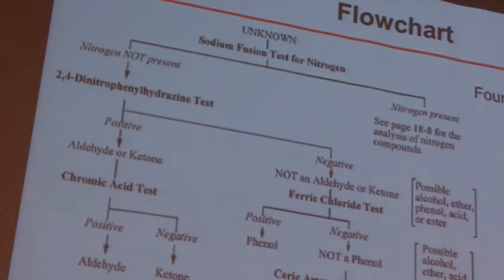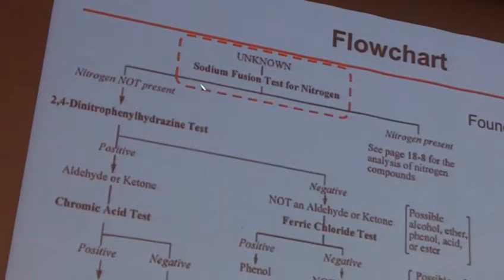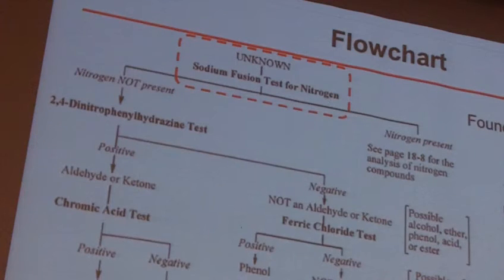You'll note that right up there on the top is the determination of nitrogen presence. The test for this is a sodium fusion test. This is a nasty, crazy test, and good news for you, we're actually not doing it this year. We had some complications in getting the material; apparently it is an antiquated enough test that they don't even make some of these things anymore.